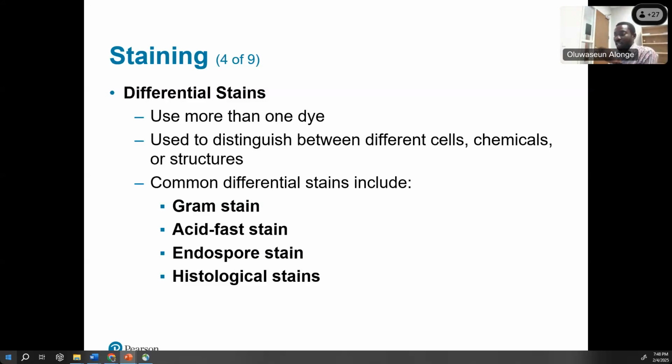All right. Eosin, which is somewhat pink, stains the cytoplasm. So you see the majority of those slides are pink because eosin picks them up. Eosin is acidic, so it's going to stain the cytoplasm. So that's the way it's a differential slide stain.